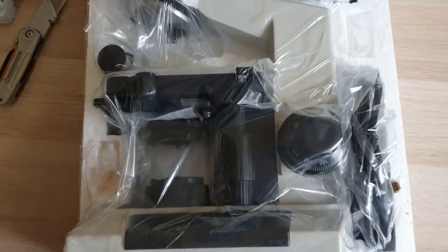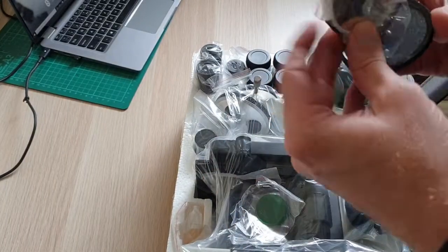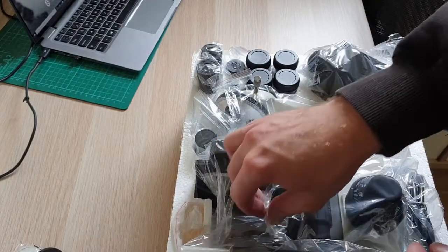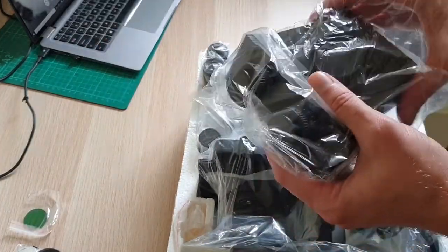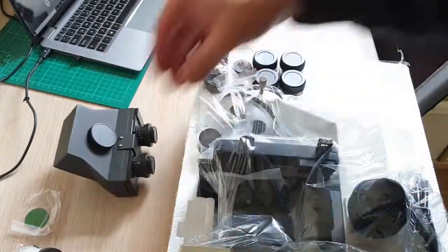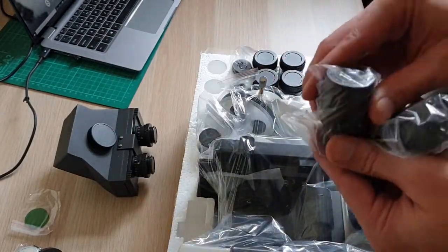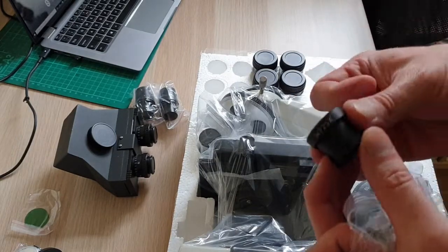Everything inside the shell is well protected and clean. There are caps on most parts which need protection from dust, and some smaller items are in ziplock bags or individual tubes like the objectives. This means that the optics are relatively clean from the factory and the microscope can be used out of the box. If you want to go above and beyond you could send it off for cleaning, but we have not found it necessary and the extra cost isn't warranted.